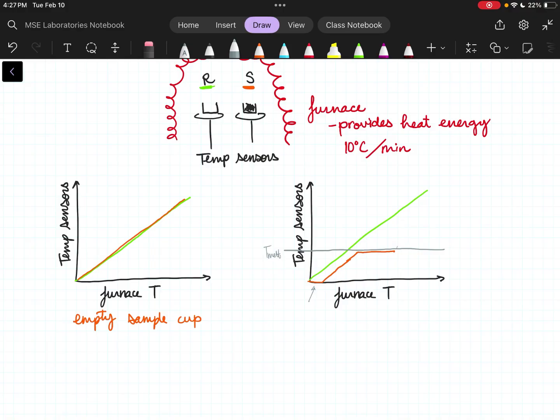At the end, when that reaction is finished, so I'm going to put a little line here. At the end of the reaction, whenever that is, all of the ice has turned to water because it was melting for long enough, and the kinetics and the thermodynamics all said, be liquid now.